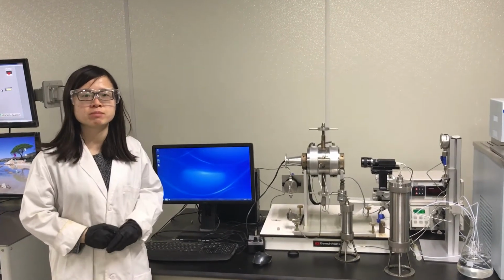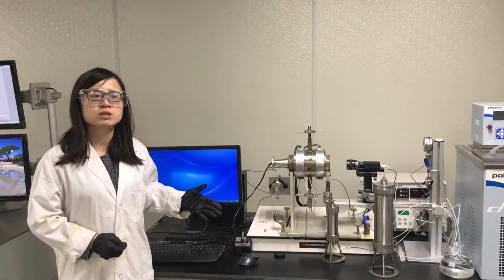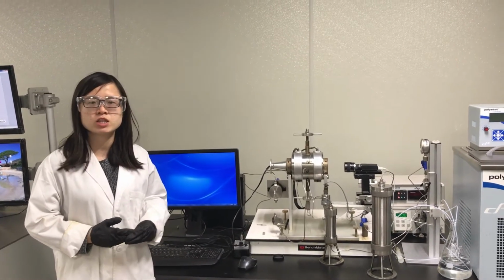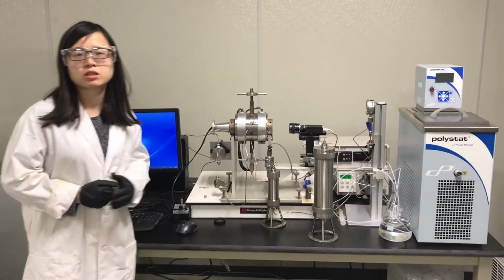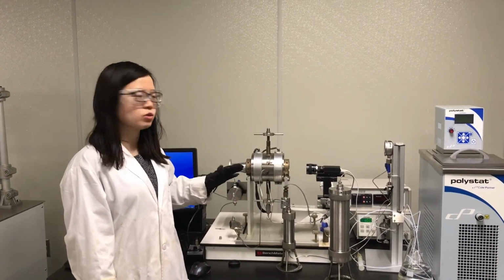Usually, this setup can be used not only to measure the interfacial tension, it can also be used to measure the surface tension and the contact angle once we use different attachments. Okay, then I will explain the details of the setup to you.